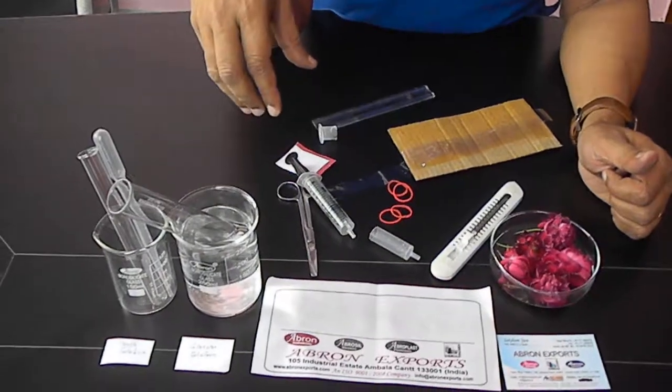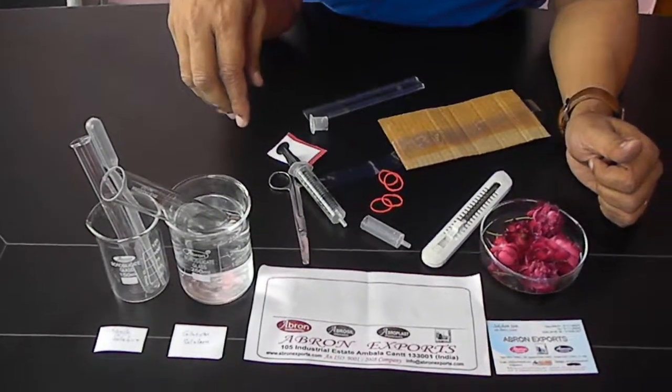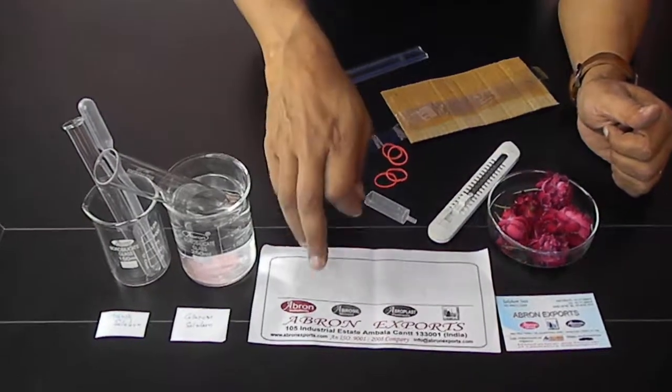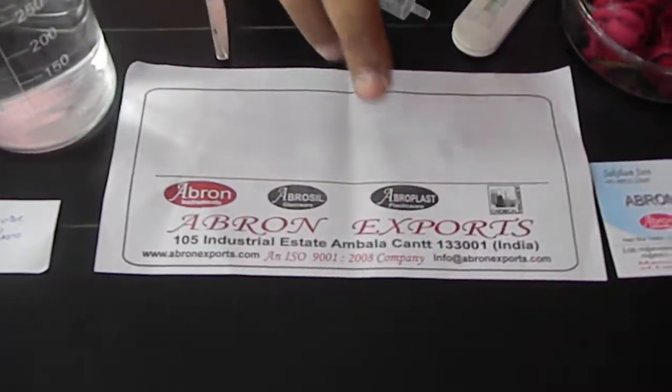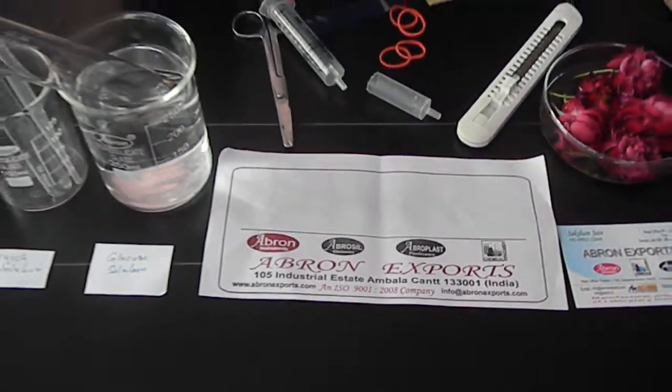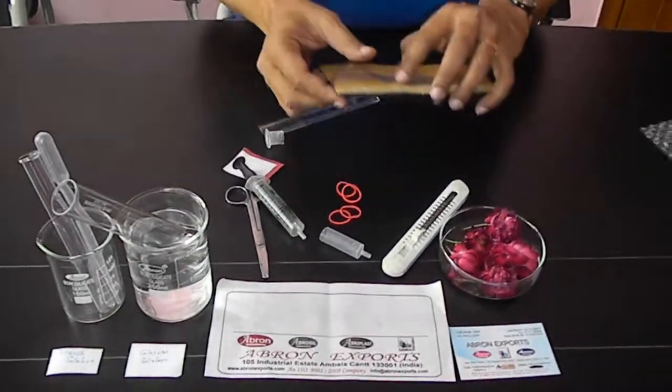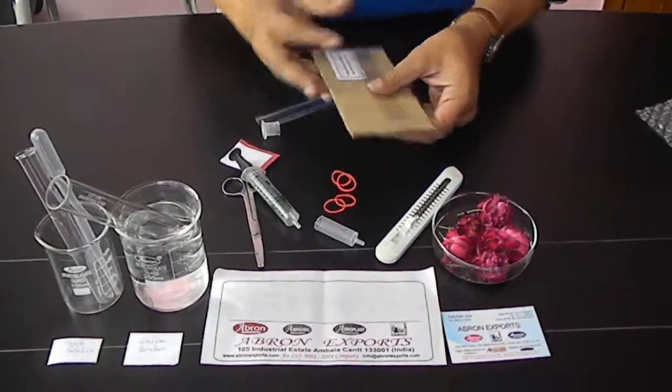We have seen it on YouTube. I will send you that link also. Do the experiment and buy from Abron Exports. This is the whisking tube semi-permeable membrane. Thank you very much.